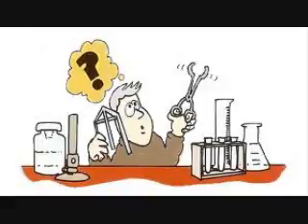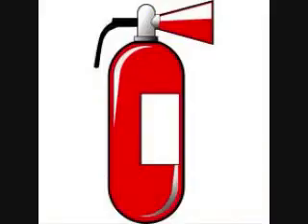Students should read all instructions thoroughly before entering the science lab. No playing around will ever be tolerated in the science lab. Students must be alert and proceed with caution at all times, and students must know their surroundings. They should all know where the safety kits and fire extinguishers are. Teachers should teach students what to do in case of any accidents. Students must follow the dress code in the science lab. These are just some general guidelines to follow in the science lab.